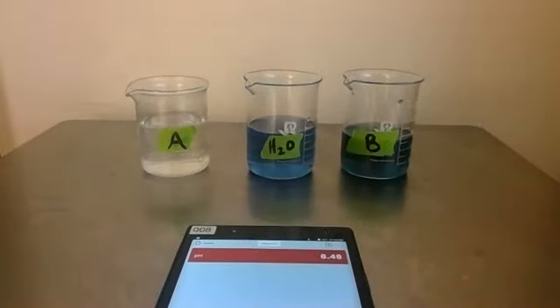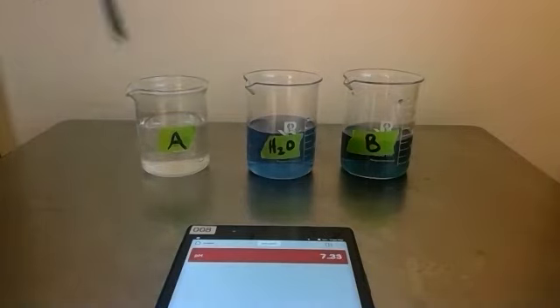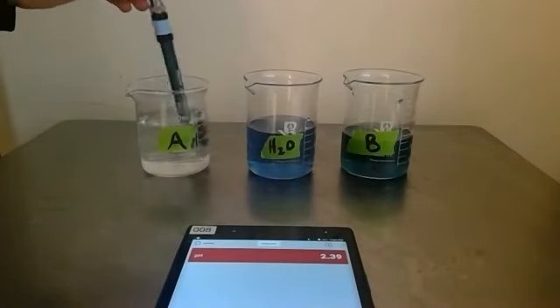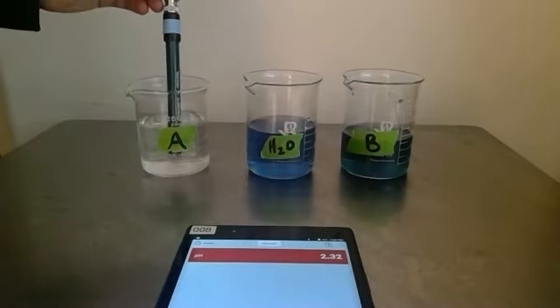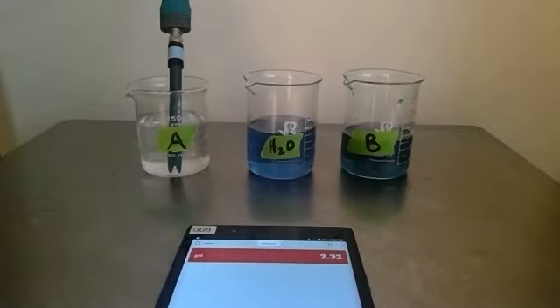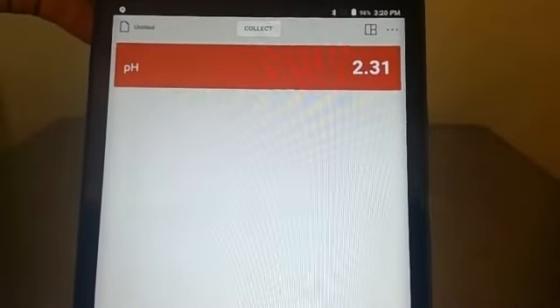Now I'm going to thoroughly clean my probe, rinse it off, and dry it very thoroughly. We're going to now look at our acidic solution. This is vinegar, household white vinegar. It's acetic acid. I'm going to stir this up a little bit and let it sit. It's a dilute solution of acetic acid. Acetic acid is a weak acid, which means it doesn't dissociate completely in water. We're having a pH reading of 2.31.